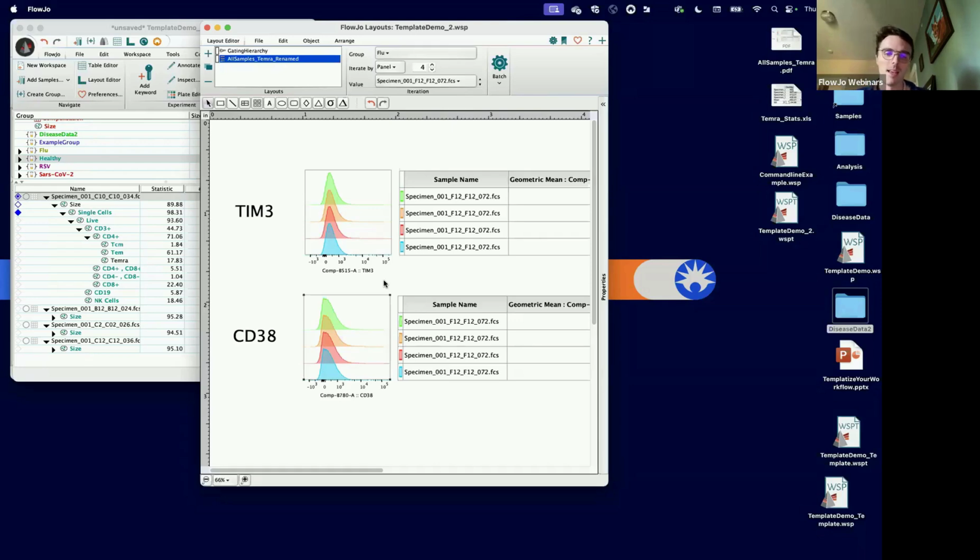just because, like I said before, if you've run plugin analysis, like machine learning analysis, and you've generated results in a workspace, and then you save that workspace as a template, those machine learning results won't come with the workspace. So you'll have to, because the machine learning almost in every case is run on a per sample basis or a concatenated file, or you've run it on some group of data, and you can't just apply those same results to a new set of data without rerunning the machine learning in some way.